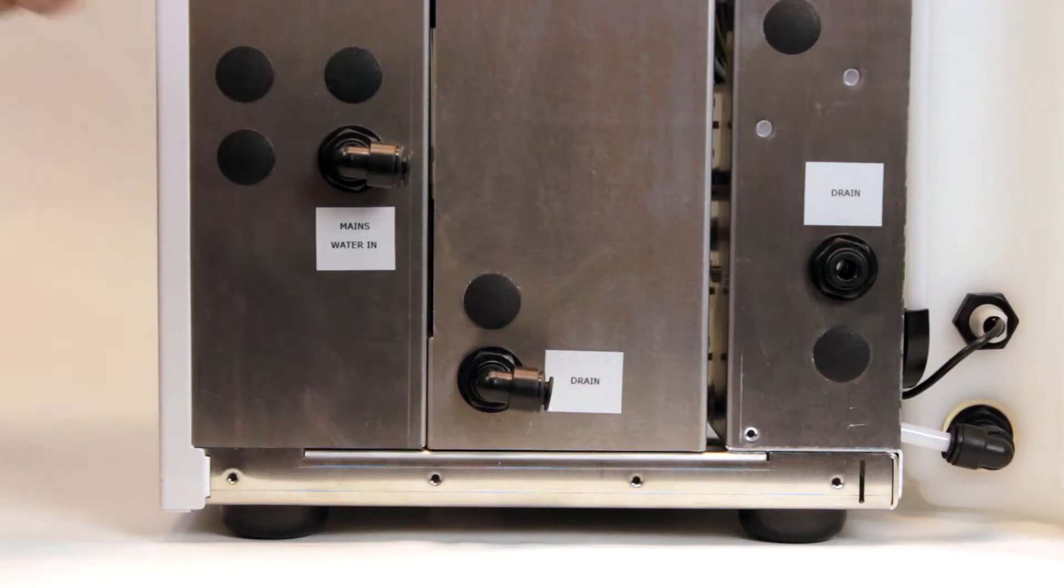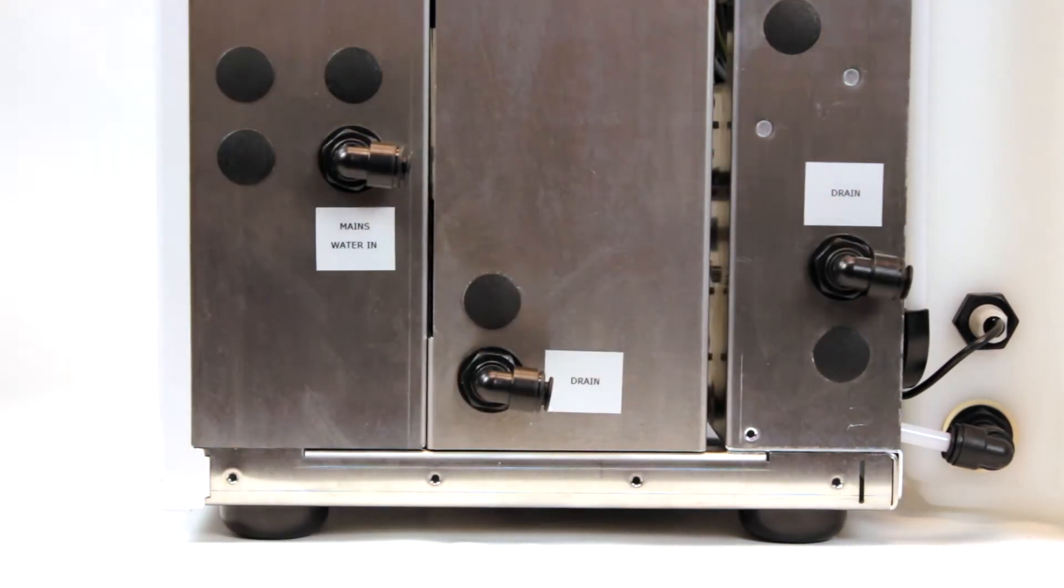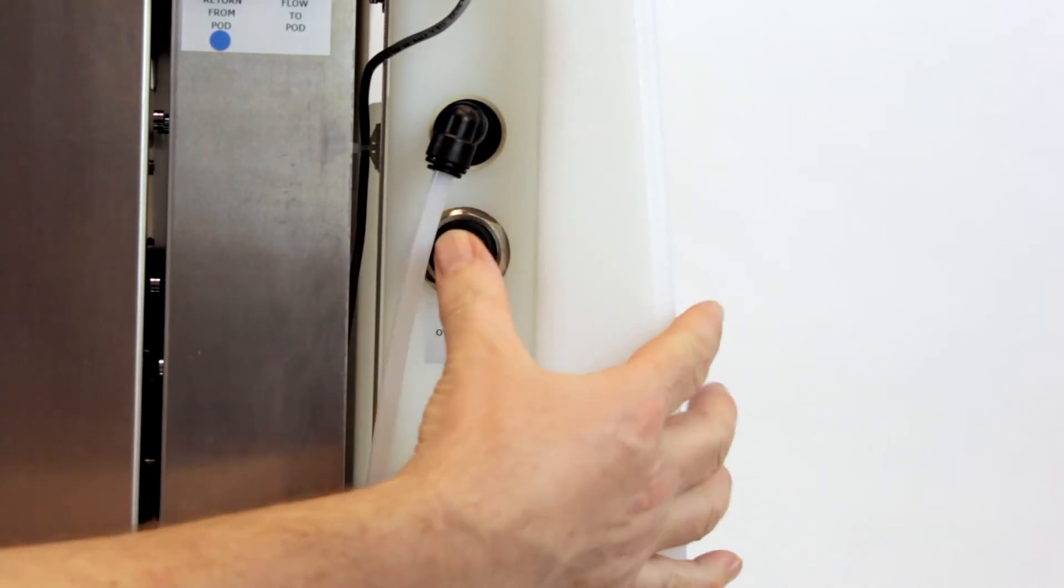Next, push fit the stem elbows into the water inlet and drain connections before push fitting the hose tail to the overflow.